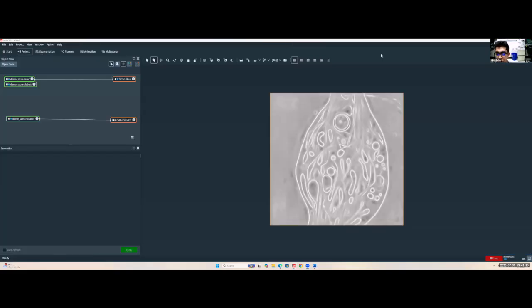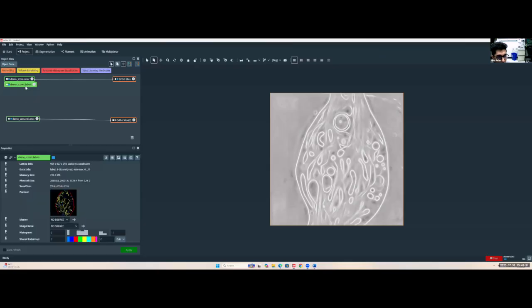Okay, so hopefully you've had fun segmenting this very rich tomogram, and we're back. One thing you will note coming back from the segmentation to the project window is you now have your demo scores.labels file attached to your scores, and this has been generated. This is our segmentation file where everything is stored. And in your properties here, you get a preview of what that looks like.